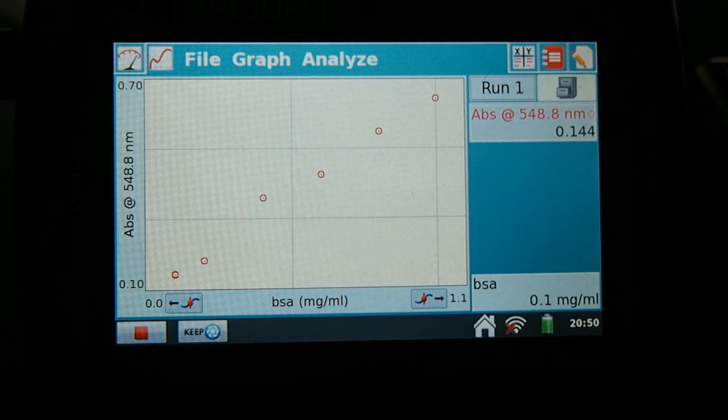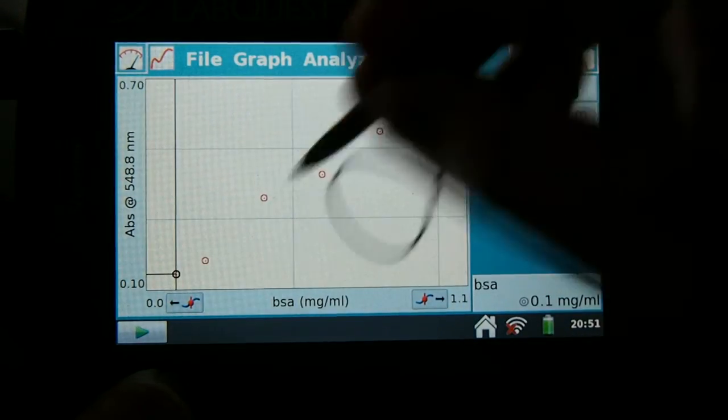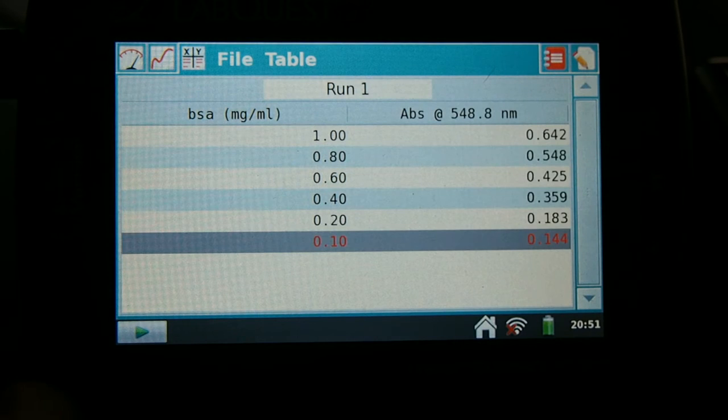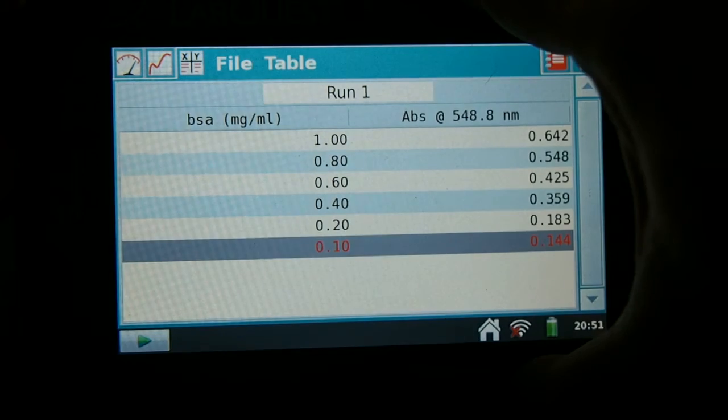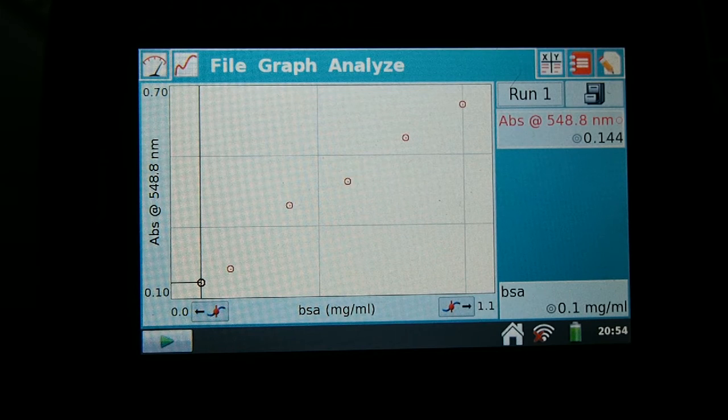When you've collected all the data and kept pressing keep, it would have stored this information after you illustrated what the concentrations correspond to. You can press on this X, Y on the upper right corner and it will show you each data point. This is useful because now we can graph it — the LabQuest does that for us. We can press on the upper left corner graphing tool, which is under graph, as you can see.